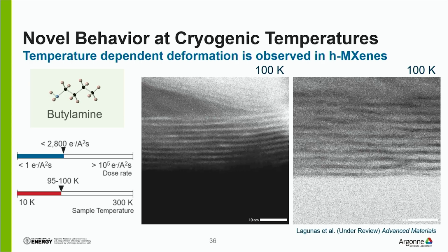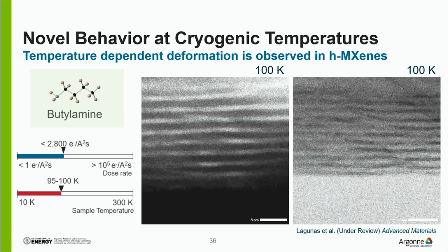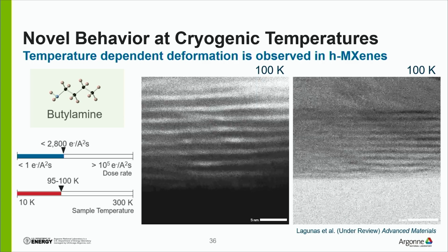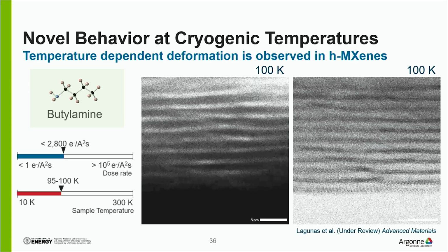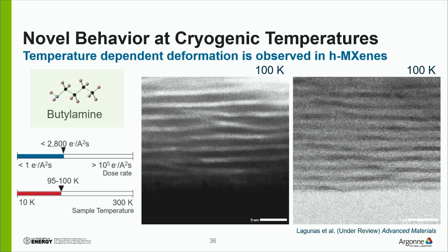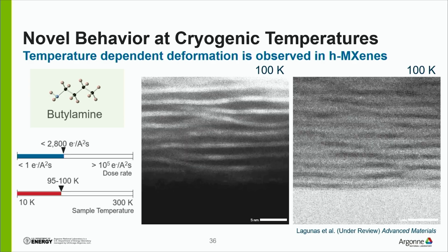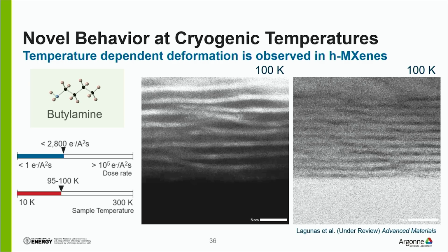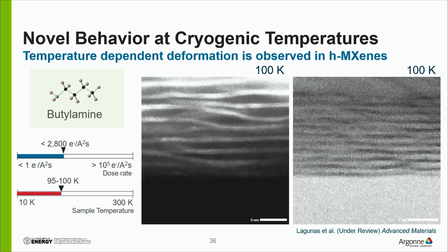So we're imaging it. Now we give it a lot of dose, and you see it kind of wiggling all over the place. And if we let this keep going, eventually you'll see the material start kind of tearing apart. You can see these Y forks and some similar defects that we saw earlier start populating. And then eventually it'll saturate along there.